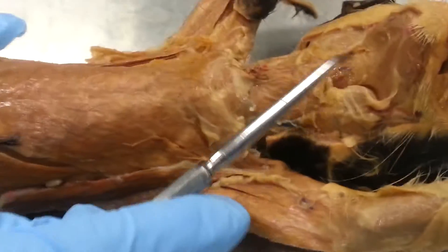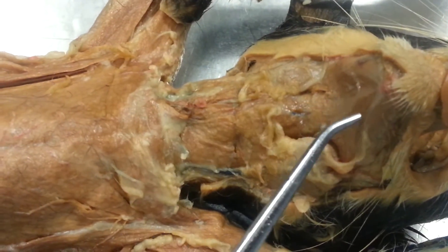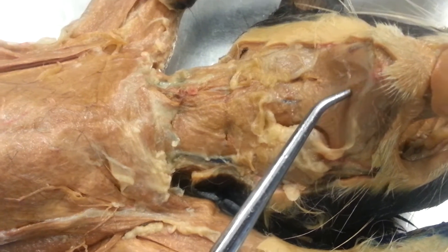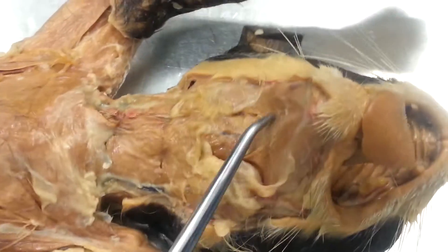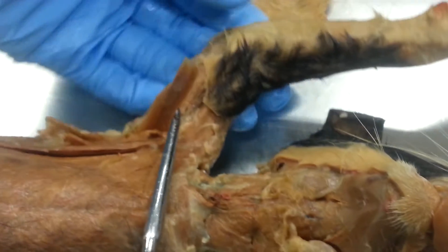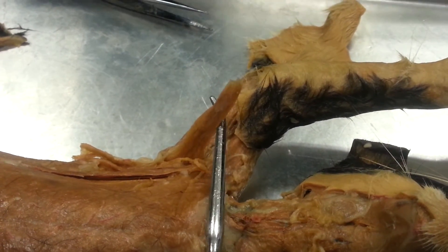So this, in the center, is the mylohyoid. And then by the side, lateral to it, is the digastric. And then right here is the epitrochlearis. Where is the sternomastoid?